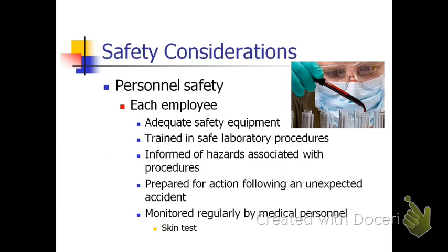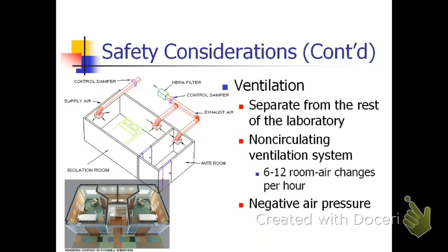So, we should consider that each employee should have adequate safety equipment. Okay, you are well trained to perform safe laboratory procedures. You are well informed of the potential hazards associated with the procedures. And then, you know what to do in cases of unexpected accident. And you have to monitor the personnel regularly, usually by means of skin tests, which we will discuss later.